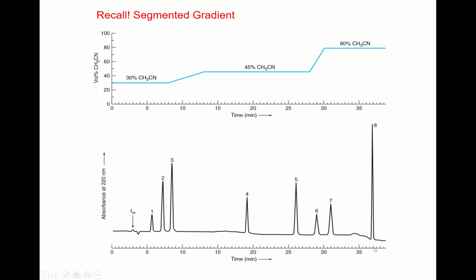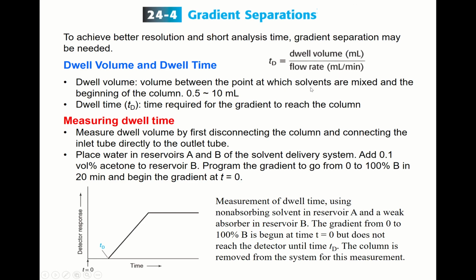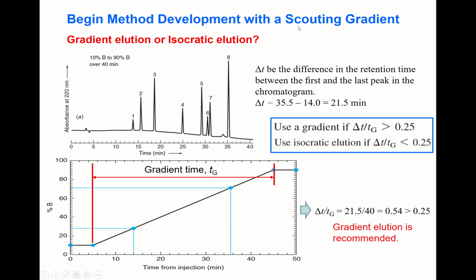Within maybe 37 minutes. Okay, this is called segmented gradient. This is segmented, although this part is linearly changing. But now we are considering linear gradient.